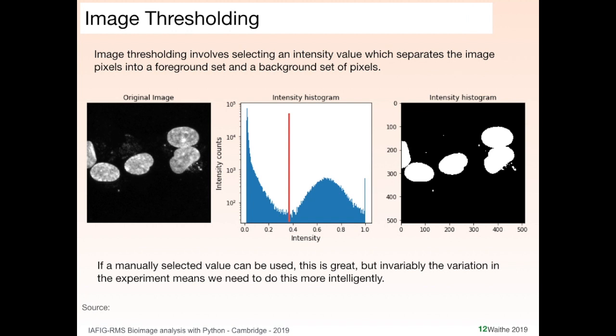Now you might see this here. This represents a little bit of saturation in our image, and you might see that in the practical later. So always keep an eye on what's going on, but this is quite a small amount, so we're going to proceed with the analysis. Okay.